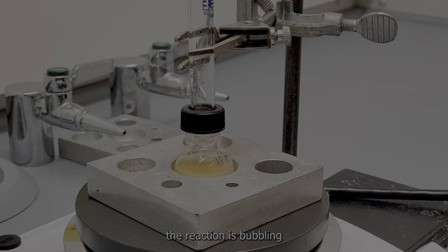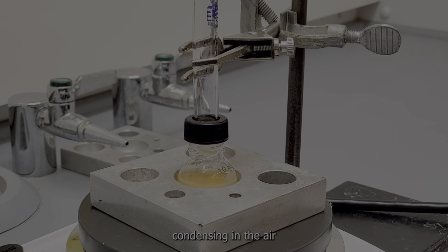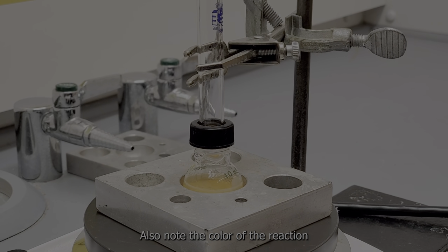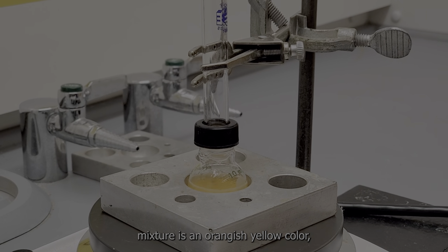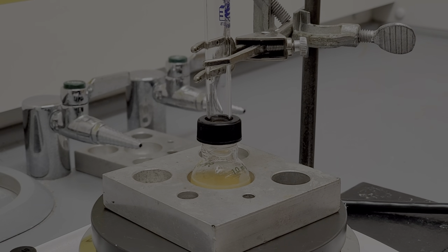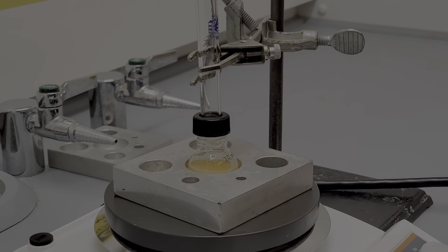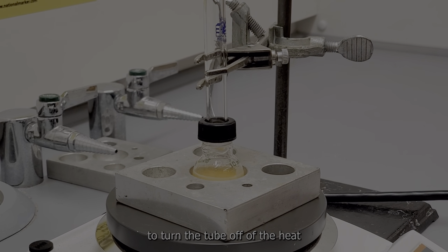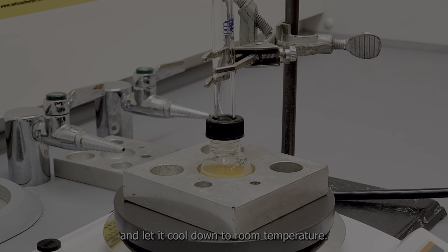Here you can see the reaction is bubbling and you can see that it's refluxing. You can see the ethanol condensing in the air condenser and dropping back into solution. Also, note the color of the reaction mixture is an orangish yellow color, a lot different than the bright red that it started off as. Once this refluxes for 5 minutes, the sample is going to be removed from the heat. Essentially, we're going to take the tube off of the heat and let it cool down to room temperature.